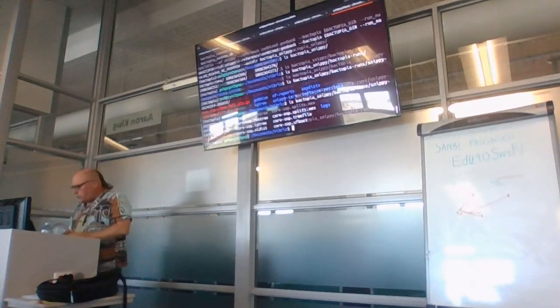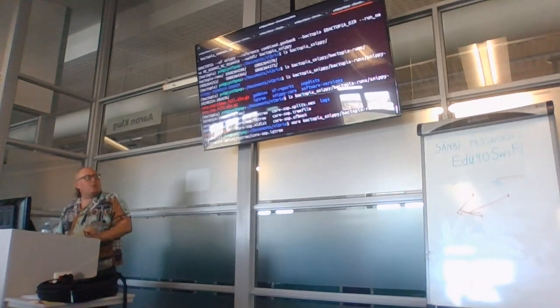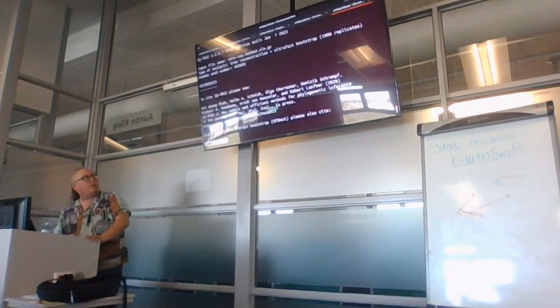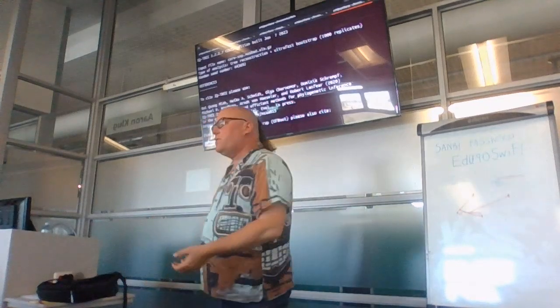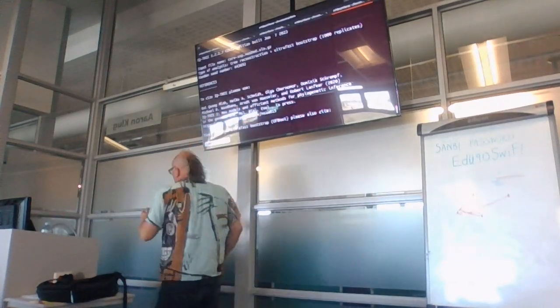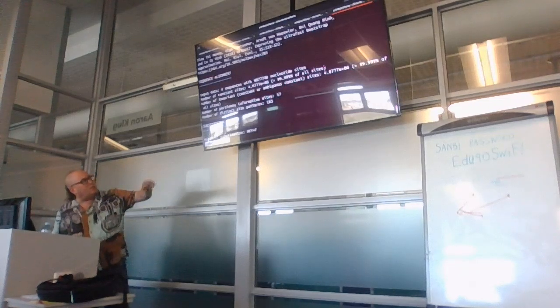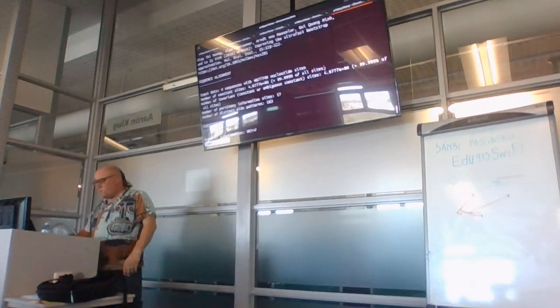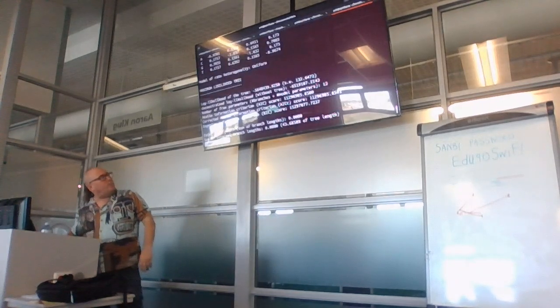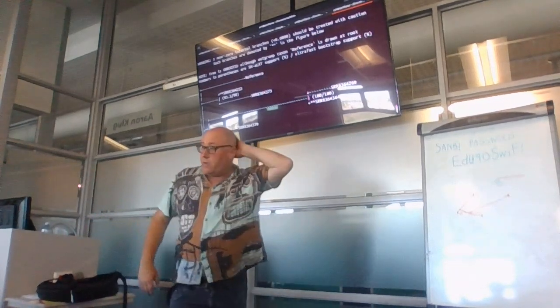So if we look at the IQ-TREE file, this is the actual log of IQ-TREE, okay? And if you've run IQ-TREE in Galaxy, this will be familiar to you. It's an explanation about how IQ-TREE is running, and one of the things that's kind of nice is it tells us which model it chose. It shows HKY plus F, various parameters, and then there's a simple text version of the tree.